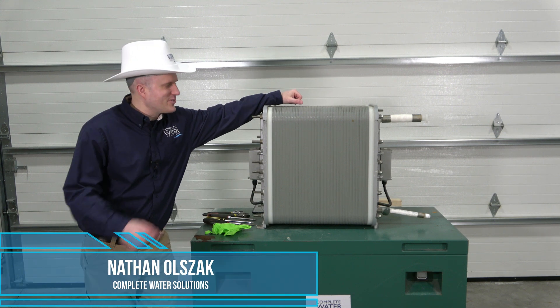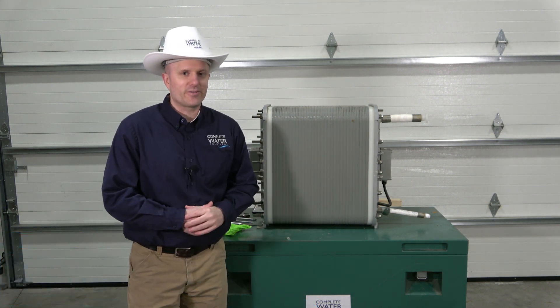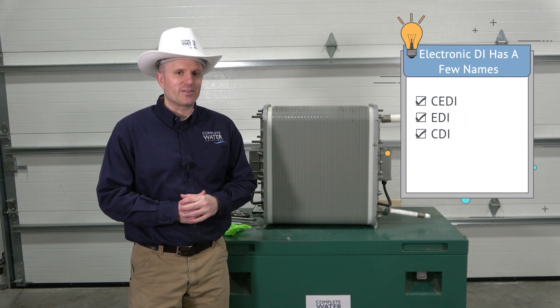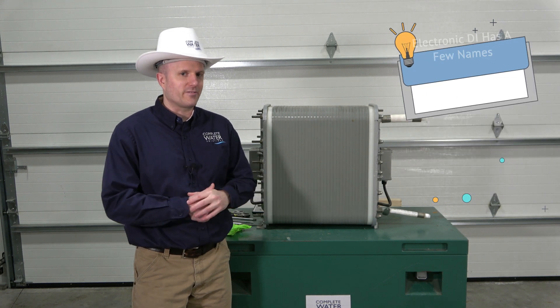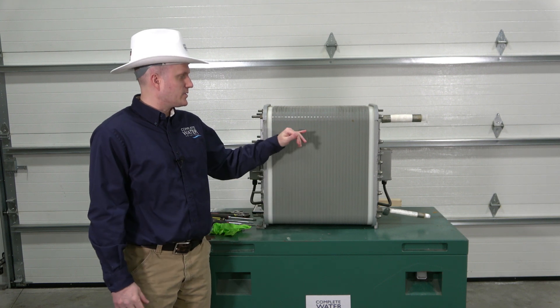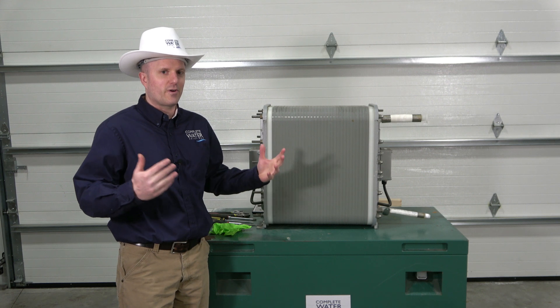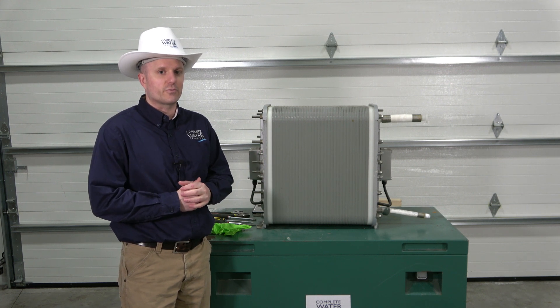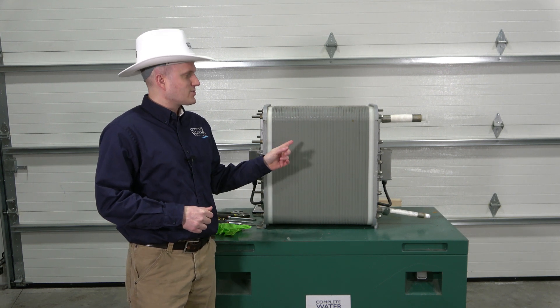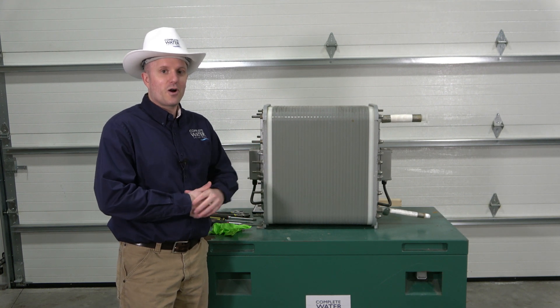Hi, Nathan with Complete Water Solutions, and today we're going to be talking about and taking apart this continuous electronic deionization stack. This particular EDI stack has mixed bed resin in it — both cation and anion — as well as membrane materials, and a cathode and anode rod, which helps function the continuous regeneration portion of the continuous electronic deionization. We're actually going to take this apart on video for you guys, so stay tuned and continue along with us.